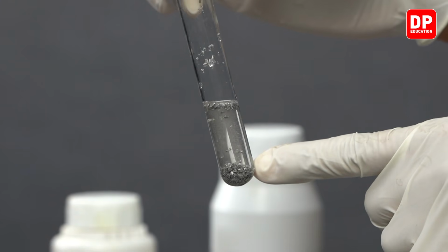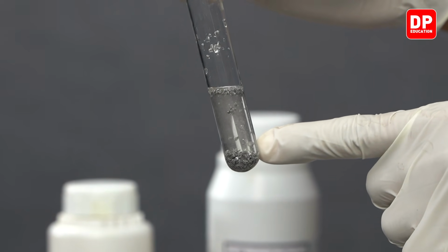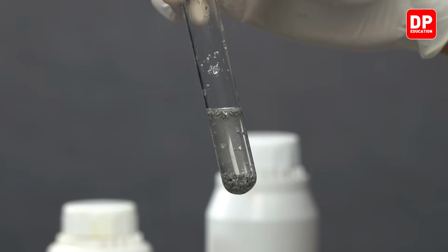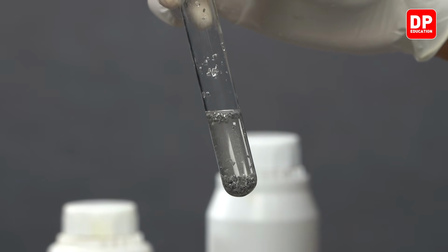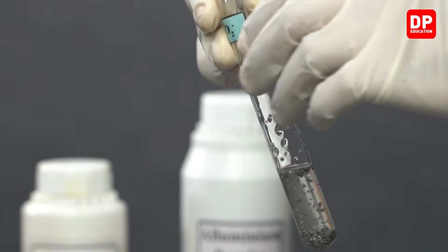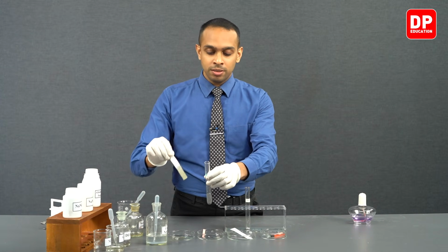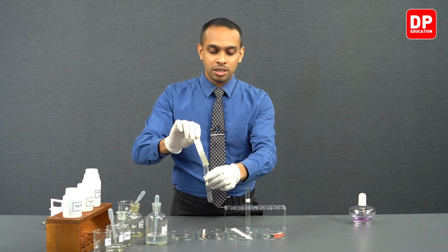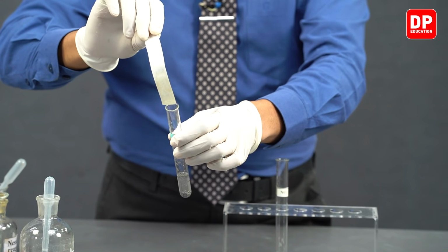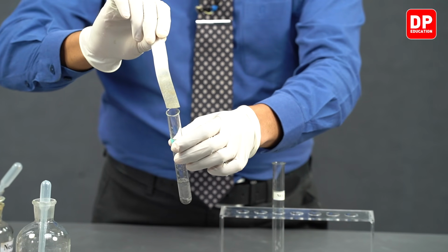So as you can see, when gas is formed here, aluminium pieces are moving up as gas bubbles are getting attached to these aluminium pieces. So this indicates that gas is formed here. So now let's hold our filter paper soaked in Nessler's reagent over the mouth of this test tube to observe if there is going to be a color change.